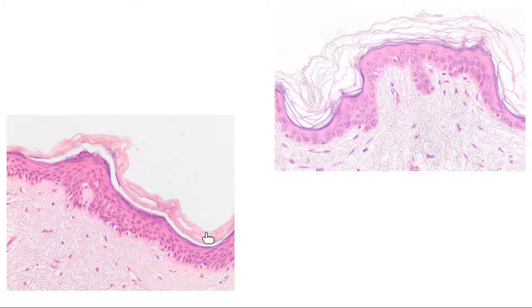So again, you can see those keratinized cells. Yeah, we're talking about the octopus arms, right? Or baby hair on a sonogram, all kinds of things that these keratinized cells look like. Absolutely. So these ones are totally full of keratin. These ones down below it are still alive. Although, as we'll talk about in lecture, this dark line of cells that we see right here is when they start to die. So everybody who lives on top, who's falling off, like that baby hair or like the octopus arms, everybody who's fallen off and dying out here, they're beyond this purple layer or this dark layer of cells. So keratinized, stratified squamous epithelium.